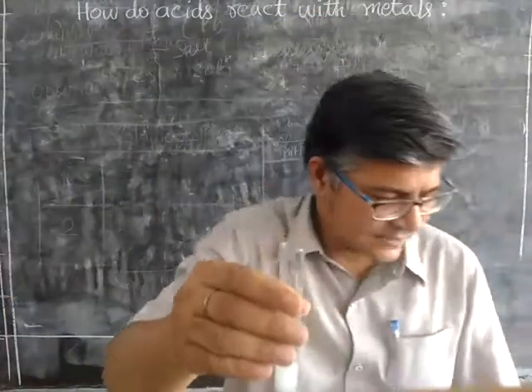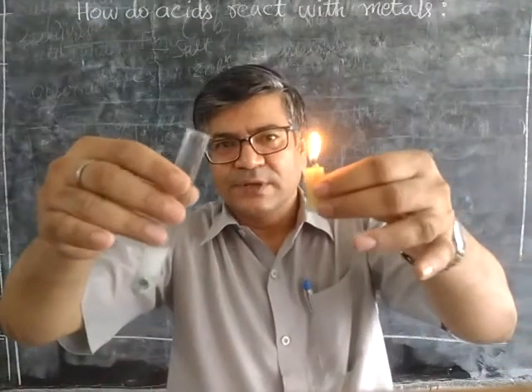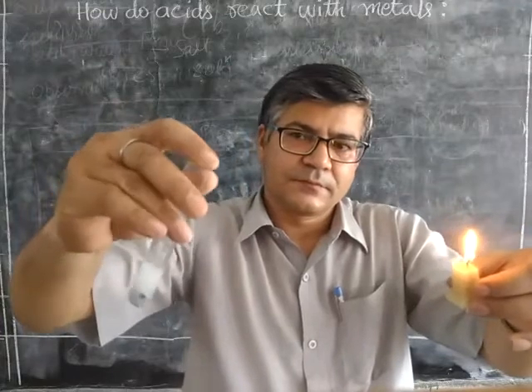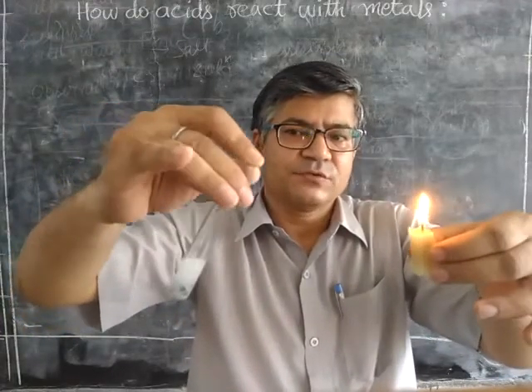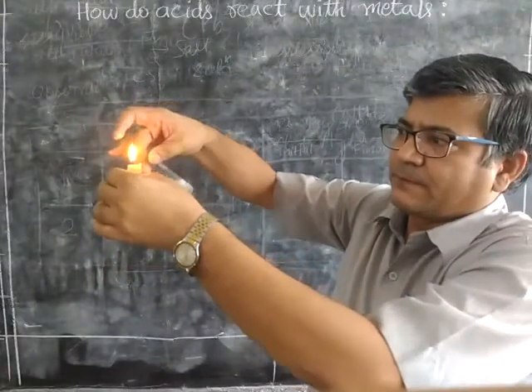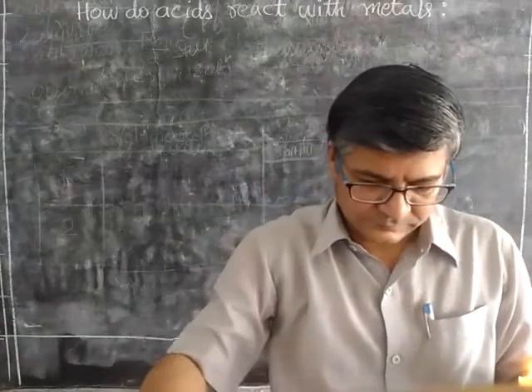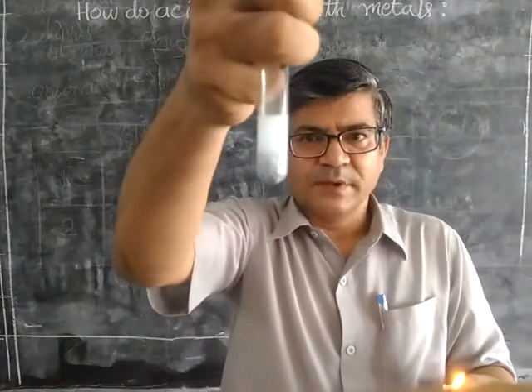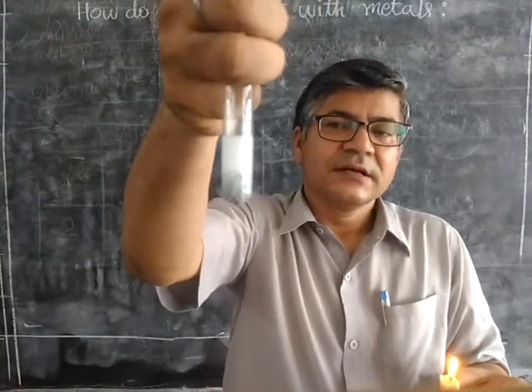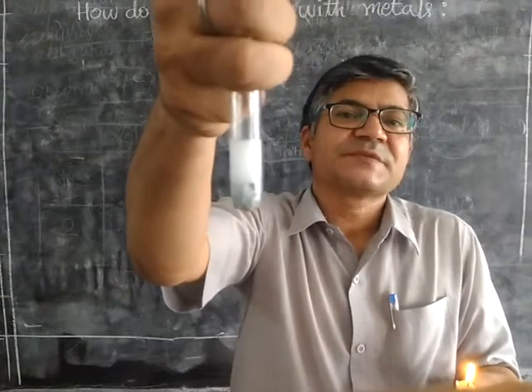It is going that fast, and I am going to bring a burning candle close to it so that we can see the reaction. I am closing the mouth of the test tube so that you can see. It will take time. The bubbles are coming very rapidly. The reaction is going fast, and this is a kind of reaction in which displacement is taking place.